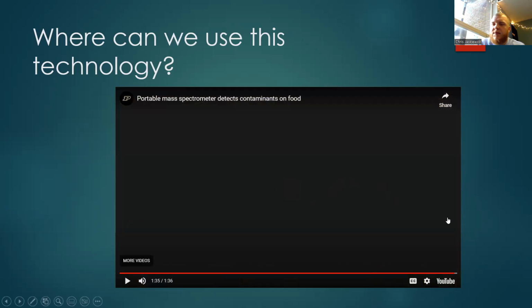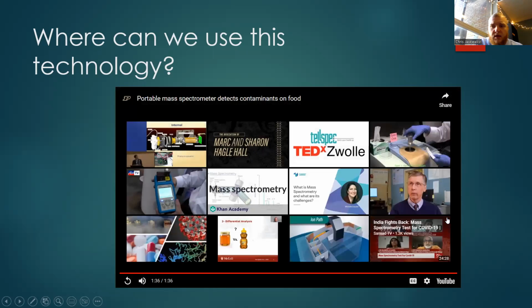Awesome. So exactly what we talked about there, right? So that video really outlines the applicability, where we can apply this technology, how it's being used, that gap there talking about how difficult it may be to transport that substance back into a lab using, he quoted, a $300,000 machine that takes up time and space, and they're wanting to get it down to this idea of being as portable as a phone to detect immediately in their application bacteria or pesticides on food contaminants. So super cool video I wanted to share with you. Let's move on here.